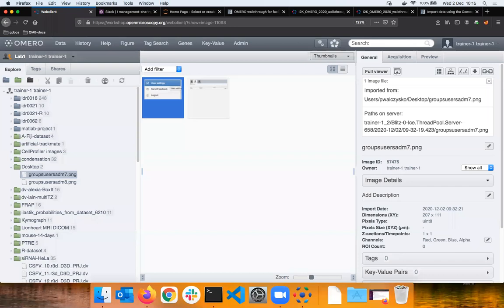If you update your image, let's say it hasn't been imported in place, and the user updates their images, changes them, or moves them for that matter, does it automatically update? I guess you have to manually update. If you want those changes to be transferred in OMERO, you just have to reconnect it. In the original file, you mean? Yes.